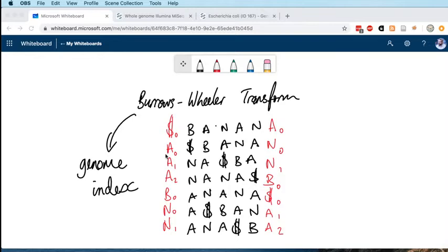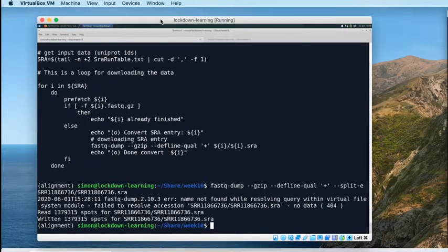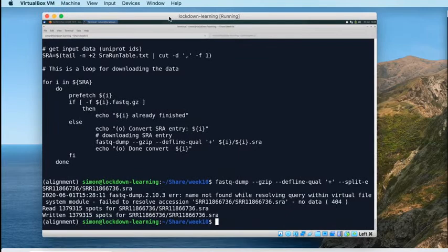So let's begin there. Let's go to our virtual machine, because these are all command line tools. So we're working back in command line Linux like we were in the early lessons. So let me get rid of that. There we go. And here's my virtual machine, which is still running from the last time out.